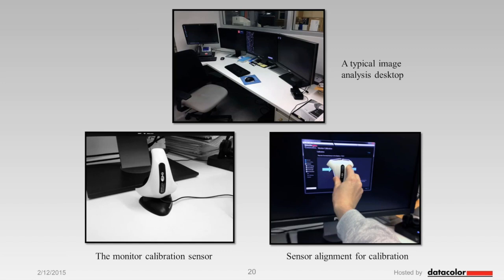They were way too much on the red side, and because I spent so much time every day working with them, after a while I didn't realize that. So yeah, I think that's absolutely something that is very helpful. And that also has another sensor in the front end which measures the ambient light in your working space and tells you whether it's too bright in there or not bright enough.